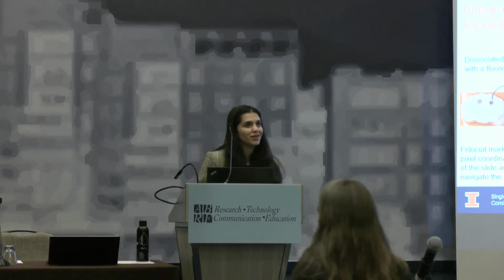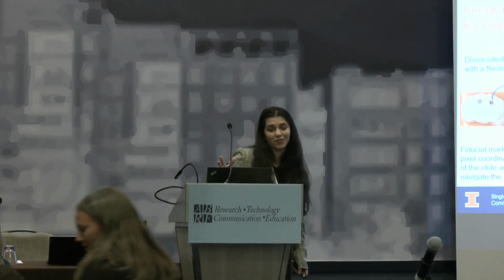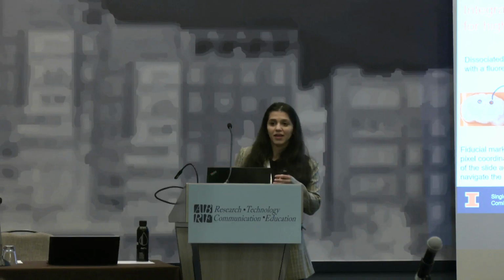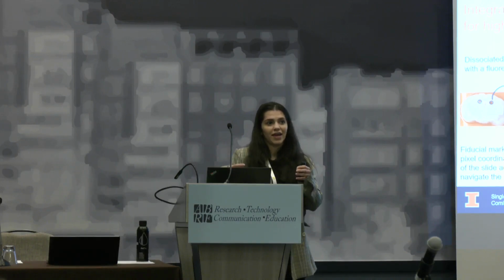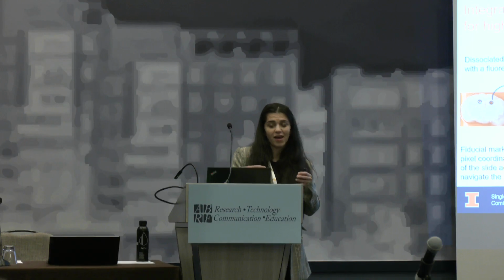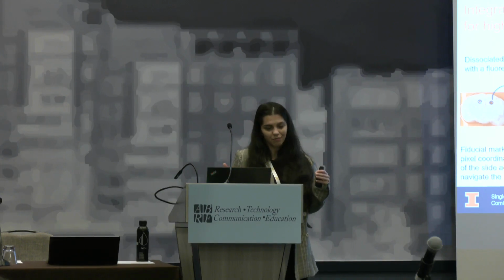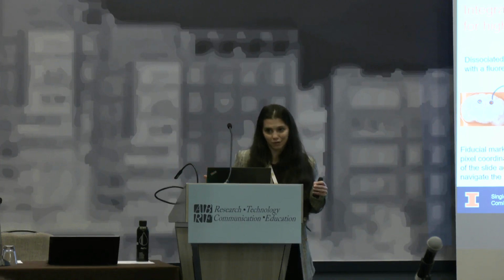So yeah, it's really hard to do that. You are going to get a spectra of not just your analyte, but also the matrix itself. There's a database as far as lipids go that you can use to confirm what lipids you're seeing. And not only that, you can also do LC-MS so that you can confirm that you are seeing a specific lipid by using standard calibrations.